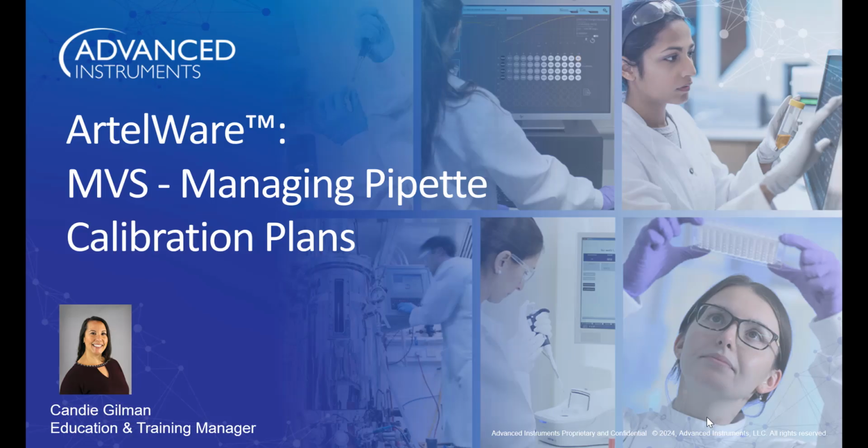Thank you for joining me for this brief tutorial focused on managing pipette calibration plans for use with the MVS in the Artelware software application. We've got a lot of ground to cover, so let's go ahead and get started.